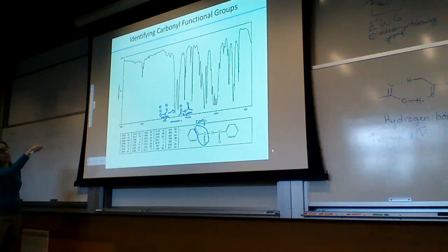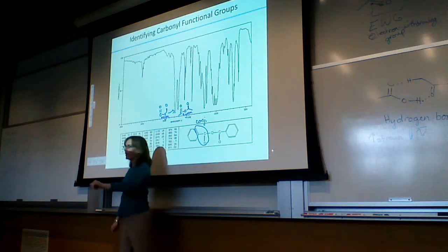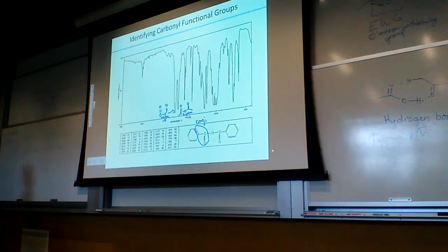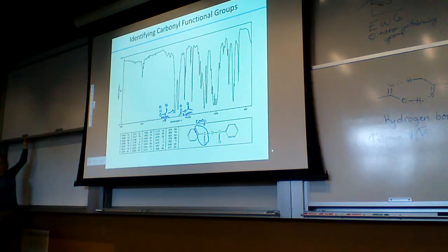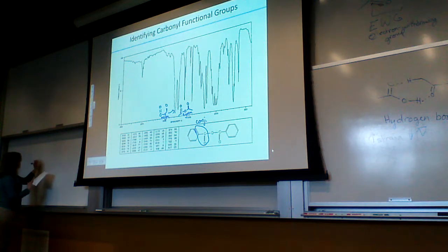And you see the aromatic peaks in here. We also see the CO bond. Well, this is where we'll have to talk about the CO bond. That's the last important one. The rest are rather unimportant comparatively. Our CO bond is going to be within the region of 1300 to 1100 centimeters to the minus 1.